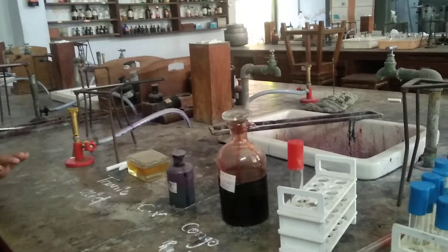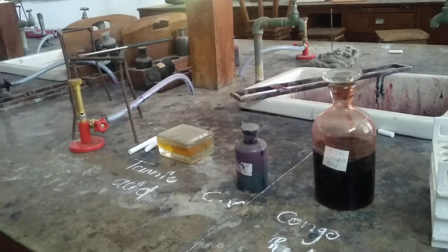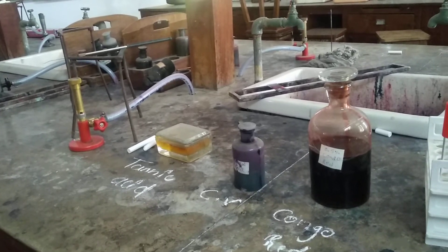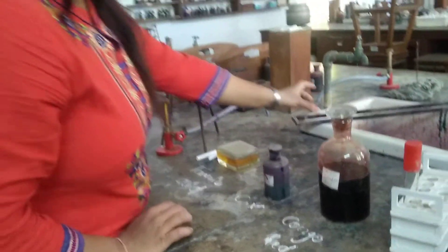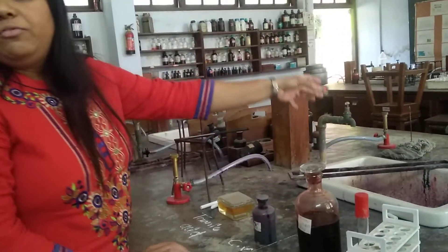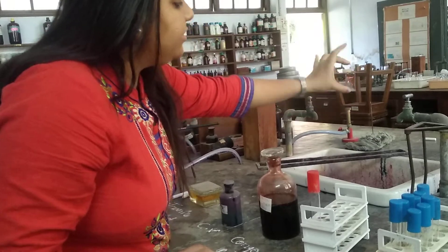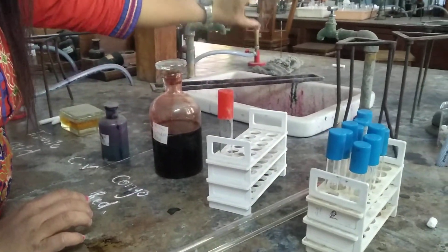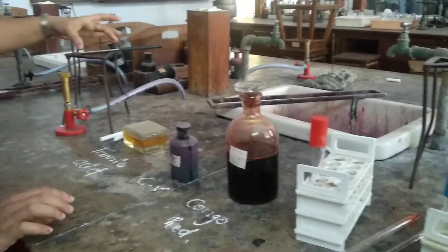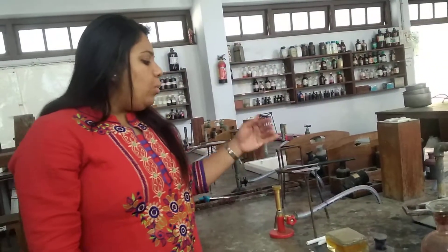Now we are allowing the slide to react with the Congo red dye. After 2-3 minutes, we are going to remove the stain — not by washing with water, but just by tilting the slide to remove the excess stain from the slide. After this, we have to keep the slide for air drying for a few minutes so that the excess stain and watery content on the slide will get wiped off.